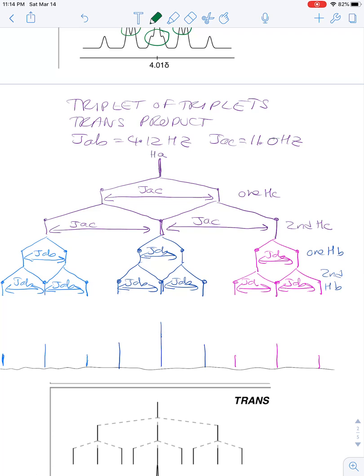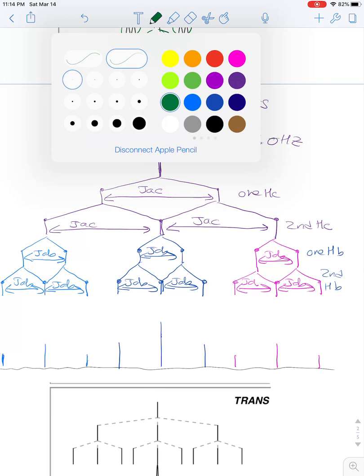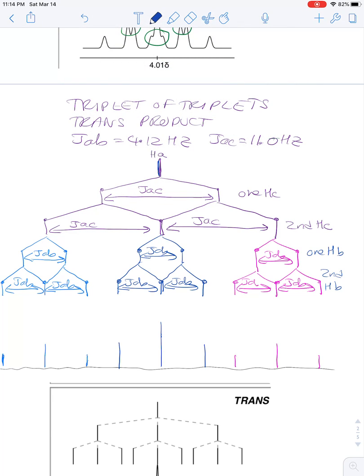The trans product is more complicated because the two couplings aren't the same. We're going to start with the middle of the signal being HA. It's generally advisable for sanity to start with the larger of the two coupling constants to get the elements spread out before you then do the smaller couplings.